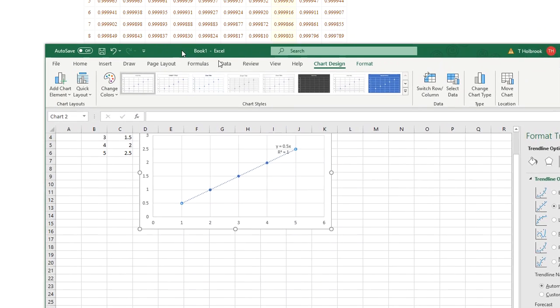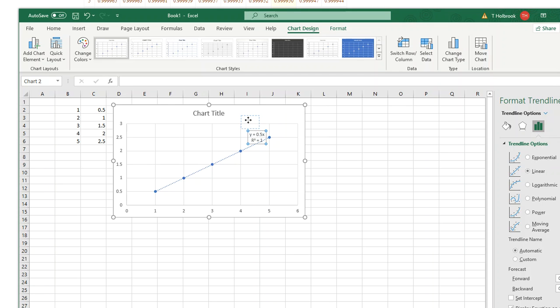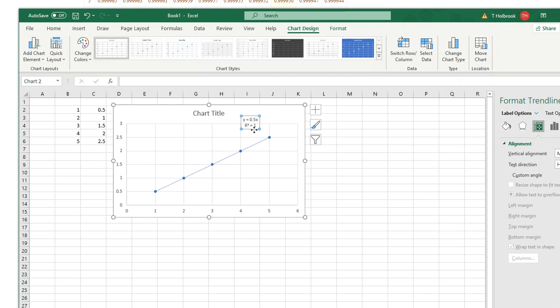Then I'm going to bring back my graph so that way you can see it. And now this equation and an R squared value shows up on my graph at this point. If this was my density example, my density is the slope, and the slope is the number that is attached to my x. So in this case, the slope is 0.5, therefore my density is 0.5. The R squared number is how good of a line that I made, which means how good of a data did I present. 1 is perfect. And again, folks, I just made up these numbers.